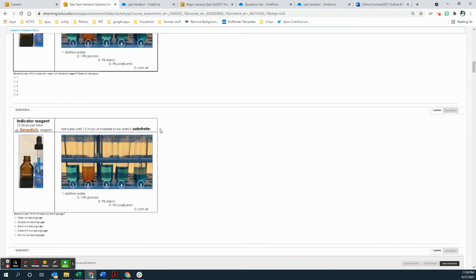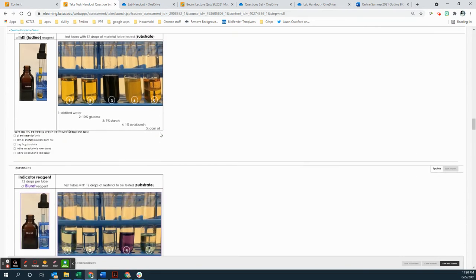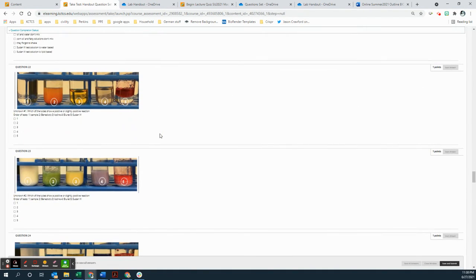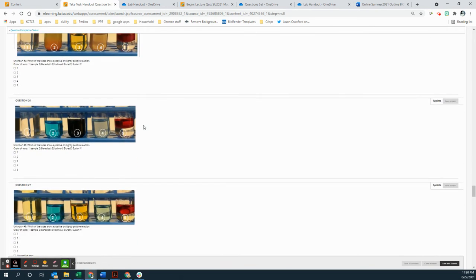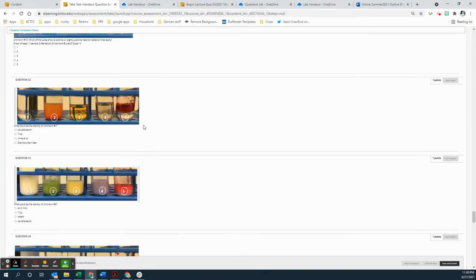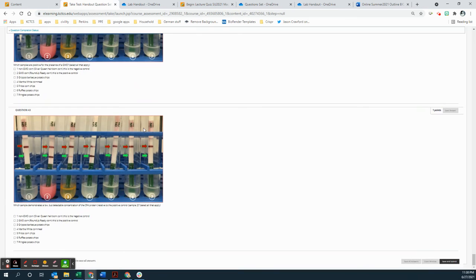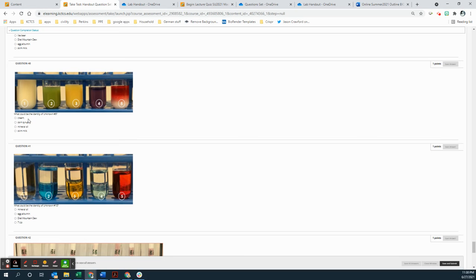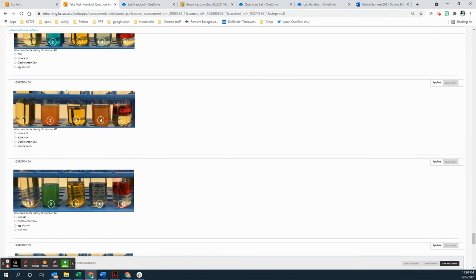And the part that I wanted to show you specifically is when you get to the unknowns, you're being asked for what's positive and negative. When you get to the questions, you have options, so I'm giving you 4 options of what this thing may be, so that you're not guessing out of the blue.